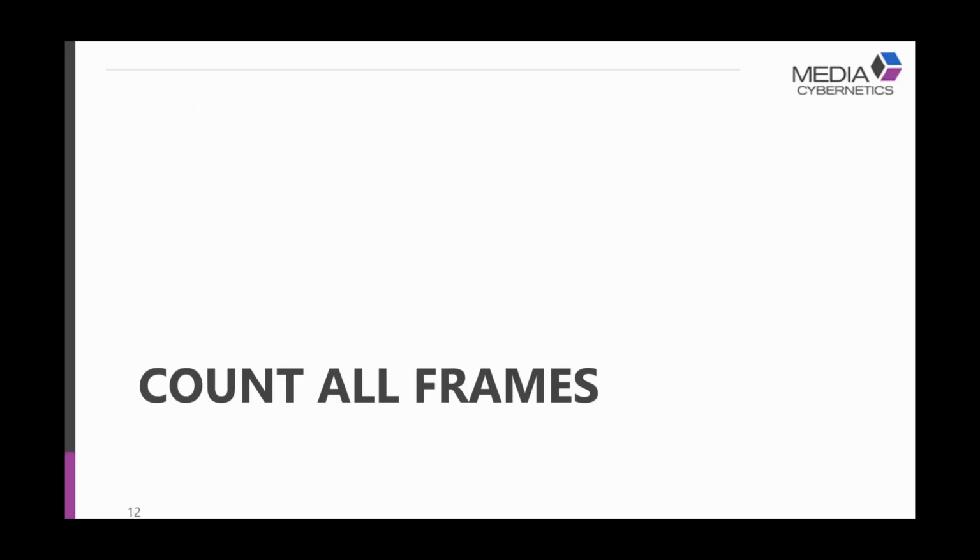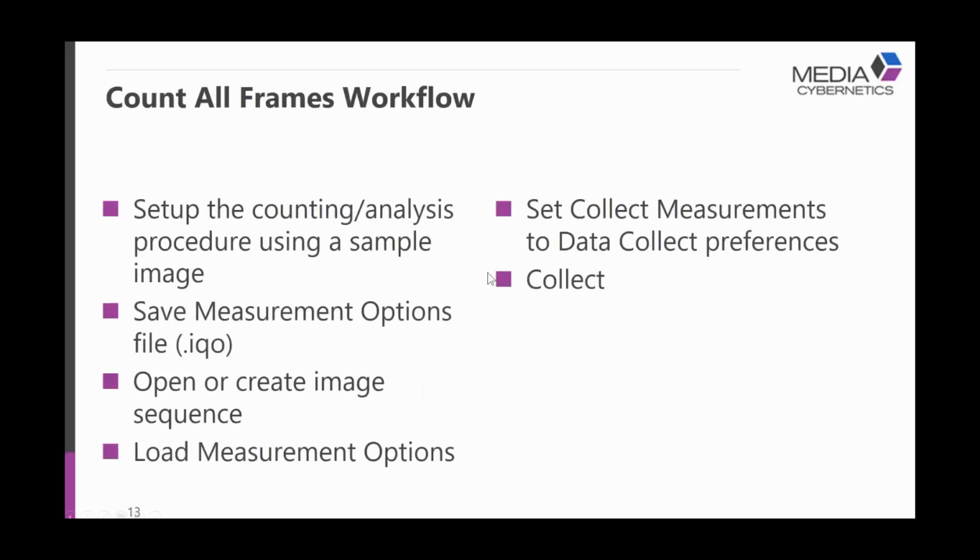This is a way of putting the images together, typically in a sequence. They could just be a series of images that have been taken together, or it could be a time-lapse. Doesn't matter. It's going to be the same technique, and then we're going to be able to count those all at once and generate the data. So now let's talk about two things, and we'll do a live demo also.